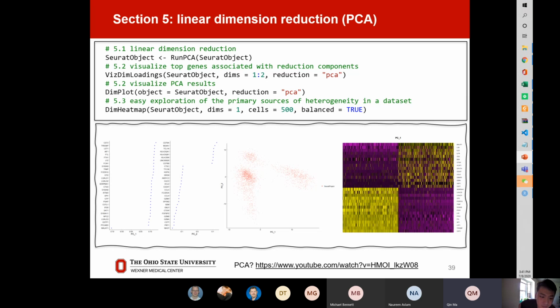Yeah. So today, let's focus on the programming part. Yuzhou, you can go ahead. Okay. After we run the PCA, this command consists of very complex mathematical theory, but it's only running with one command. Very simple, right? You just run PCA, and you can get immediately the output of PCA.